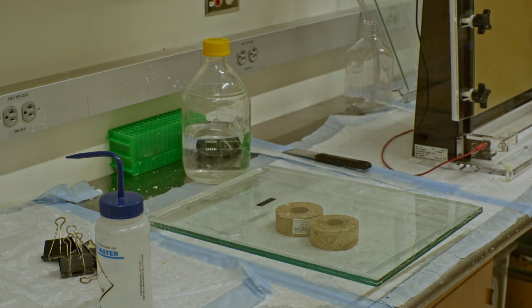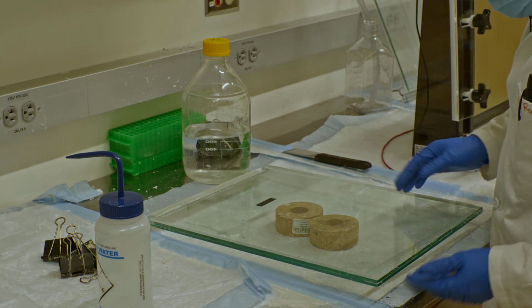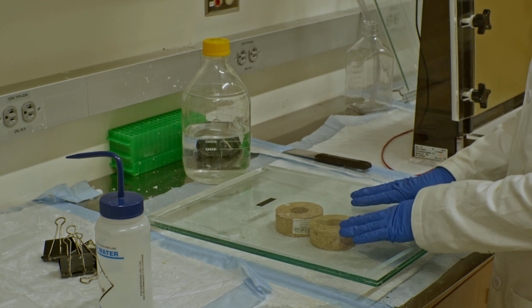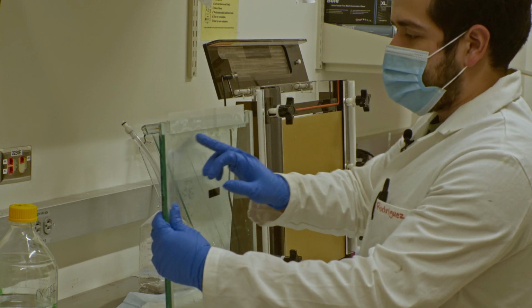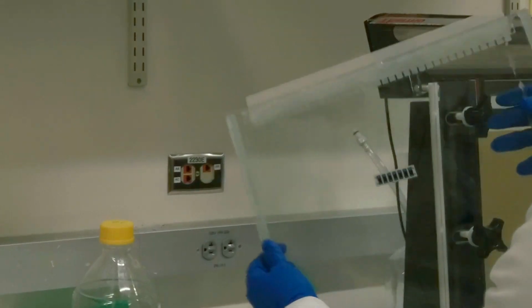You can see that the gel is perfectly inside there. There are some extra pieces hanging out, but that's perfectly fine. So the next thing we're gonna do is move this over to the gel box apparatus. So now that I have my gel ready to go, this U-shaped piece of glass should actually be facing the back of the apparatus. So I'm going to give this a flip.